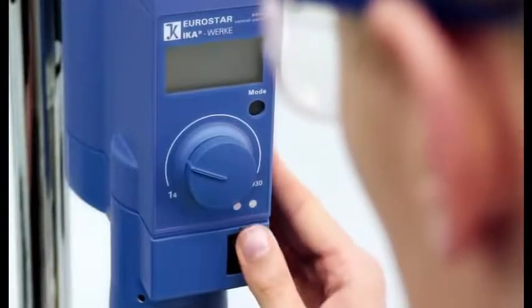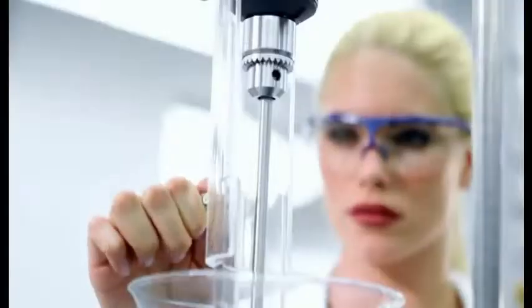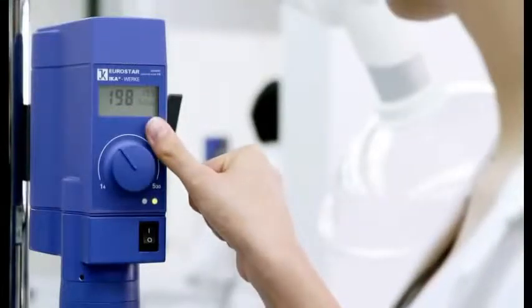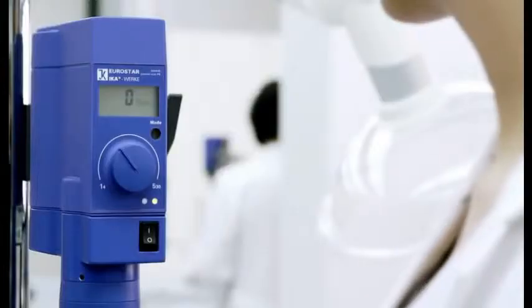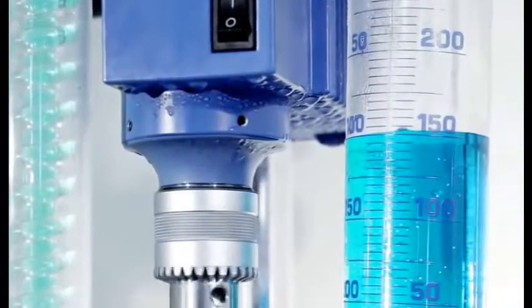Advanced overload protection. Stirring shaft protection available for all units. Integrated torque trend display. IP42 compliant housing reliably protects your unit.